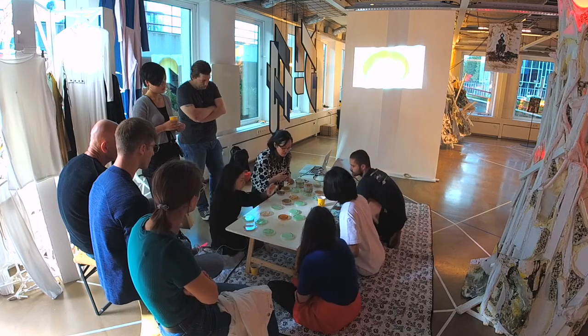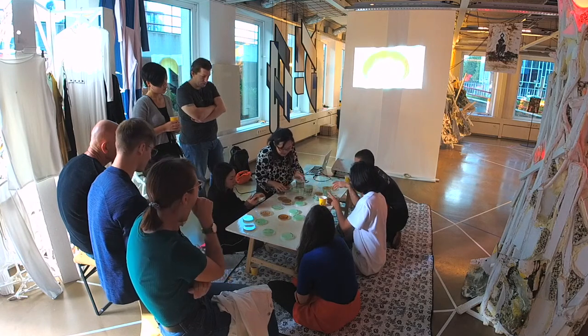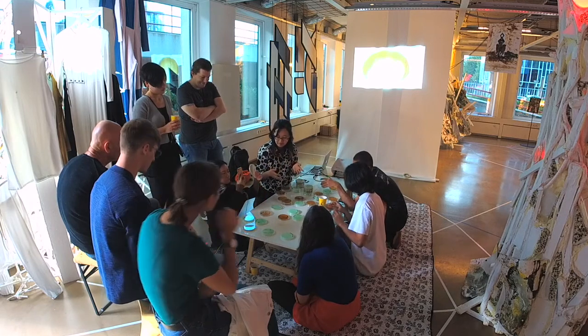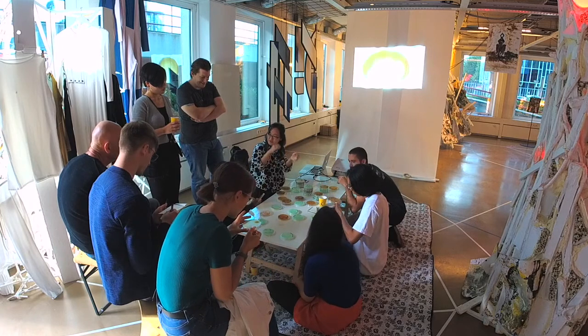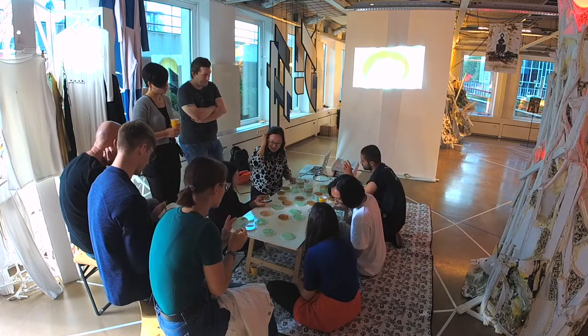Yeah. So you can also do the same if you look at these. Some of them closely, you will see some of them have different shapes and different colors throughout time when they grow and become bigger. And then you can try to isolate those that are visually different to a new Petri dish, so you can separate them basically.